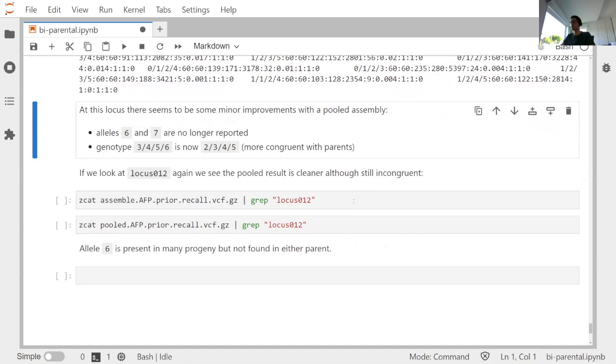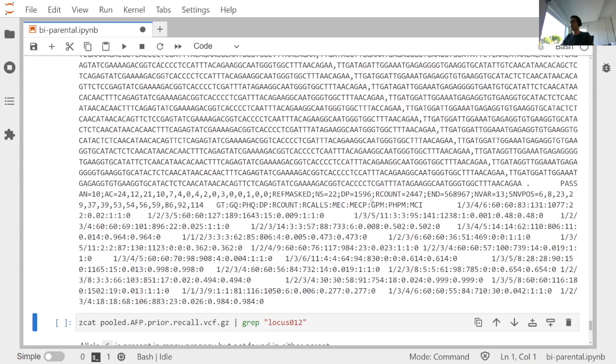Going back to the problematic locus: looking at the pooled assembly approach, the result is a little cleaner, but we still have allele calls in some progeny genotypes not present in the parents — still indicating something unusual is happening there. That's actually a good thing, because if there is genuinely some copy number variation at that locus, we don't want a prior so strong that we force all genotypes to make sense when they shouldn't. If there is real evidence of incongruence in the data, we want that reported in our output.